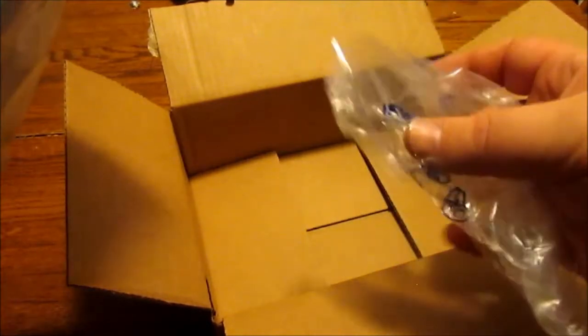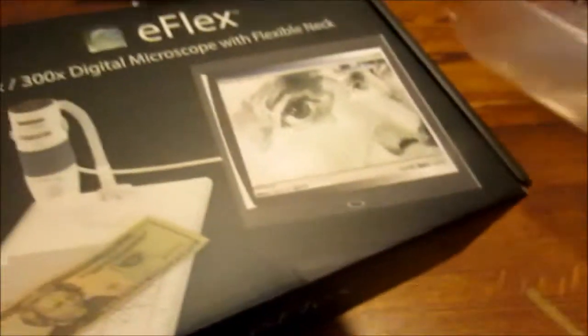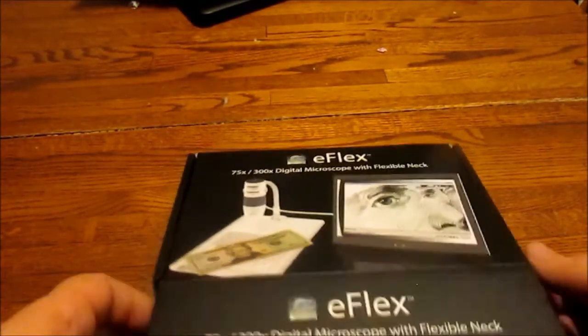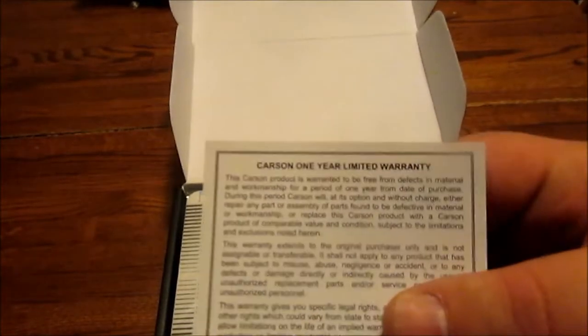Let's get into it. I opened this box from Amazon and my little puff pack was just broken — very upset with that because that means this thing was just rattling around like crazy in there. But it's Amazon, not eBay, so if it's broken I get a new one. The plastic sleeve was completely not secured, but again — Amazon. The box feels very light.